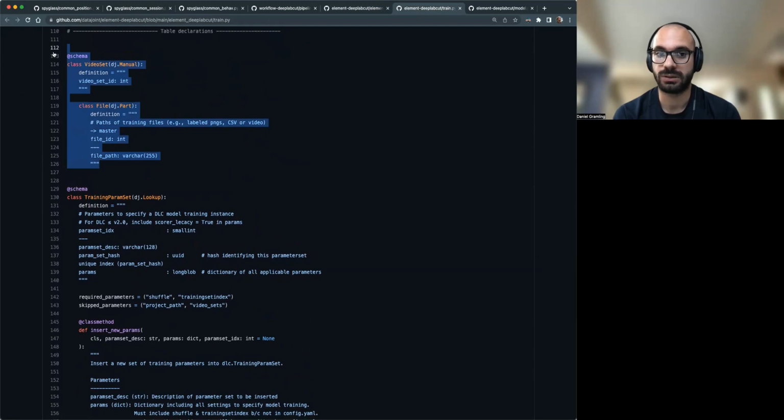If you looked back in the history, at all the commits on this, you would see it was initially called something else, with a previous assumption that these are just going to be the videos you're training with. We then expanded it to permit the use case whereby someone wanted to, within this video set, keep track of multiple videos, but also the labeled PNGs, to keep more detailed records of the items they're maintaining.